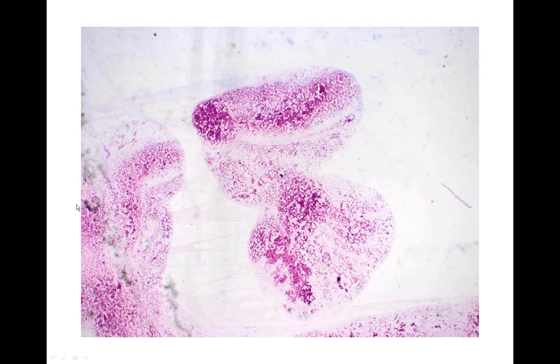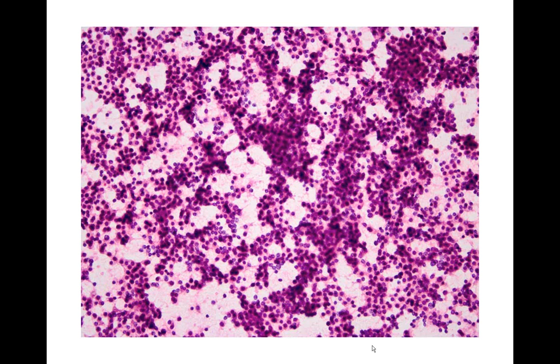Each little blob of cells that you see here and here and here at low magnification, that's where I touched the tissue off directly with a pair of forceps, just touched it right onto the glass slide. It's super fast. Goes through the staining, and at higher magnification, you can see wall-to-wall cells.